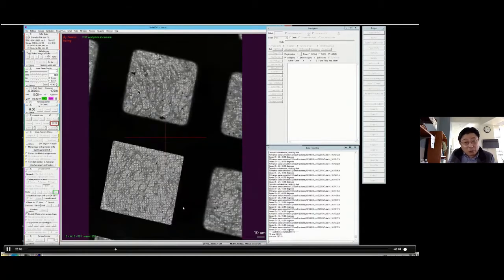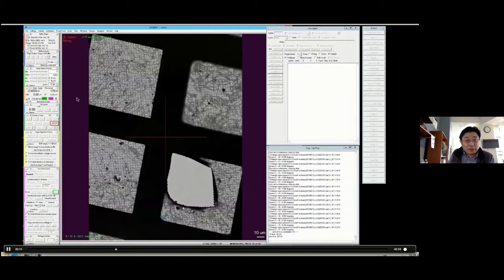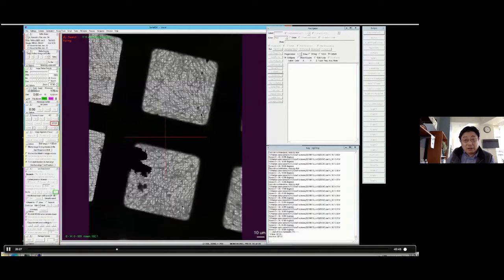I always tell the people in my lab, when you're using the microscope, it's a war zone, because the microscope is so expensive. And so the more you can get out of it, the better. Okay, so obviously things will show up very quickly. For the different mags, you want to be sure they're in the same area. So they have to be aligned. And so I think it's there.